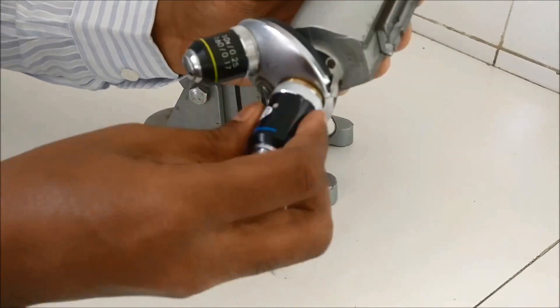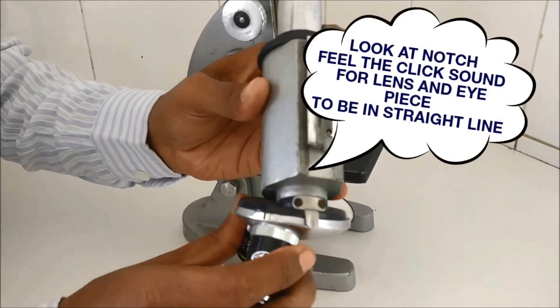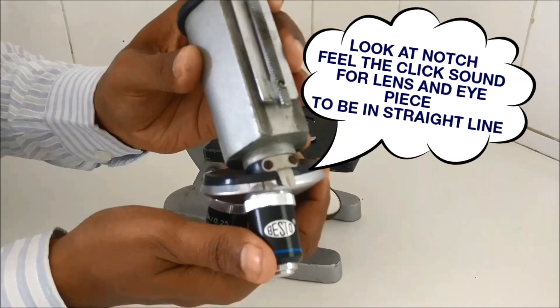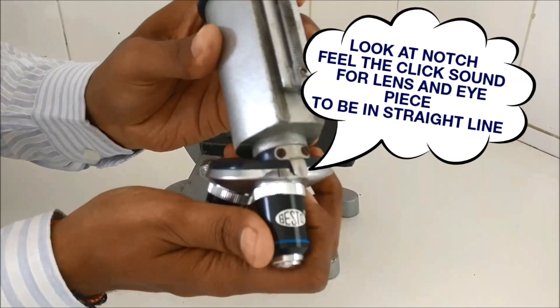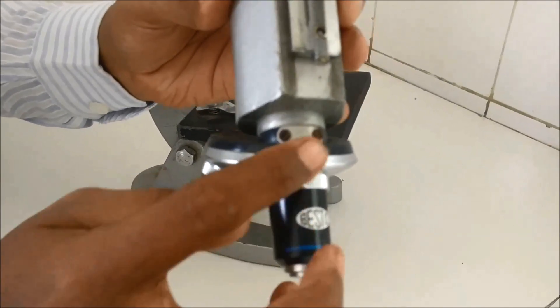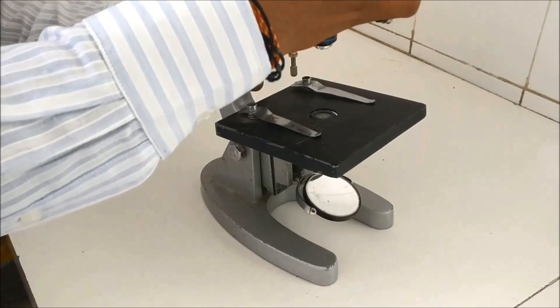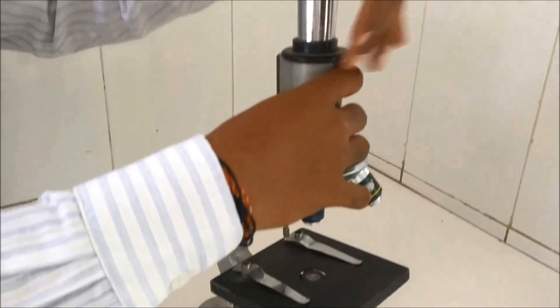Place the lens properly in the nosepiece. When you see this notch, if the lens is in the proper position you will hear a click sound while moving the nosepiece. The lens and the eyepiece should be in a straight line. Now the body tube goes back into position.